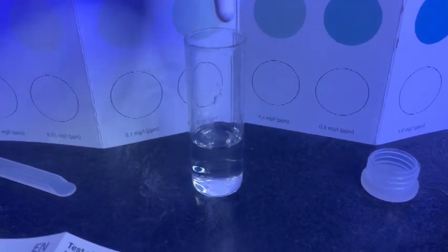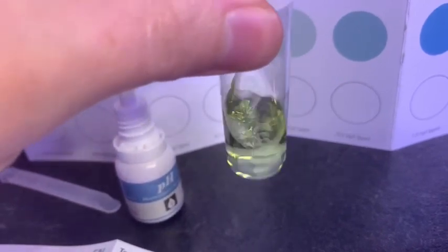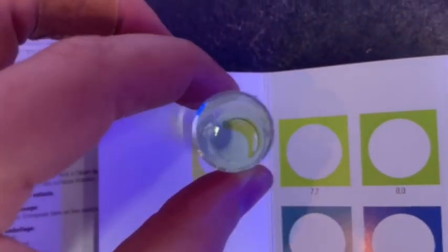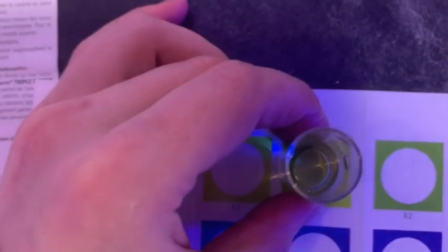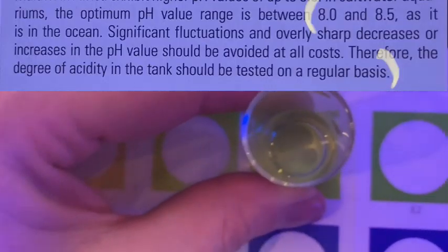And now the pH test. Prepare the vial in the same way, and you just add one drop to five mils of tank water. Give it a little swish around, and in exactly the same way, just match up to the corresponding color by looking down. I've found this really easy to read — sometimes color charts are really difficult, but you can see this just matches up really well. So I've got a pH of eight.